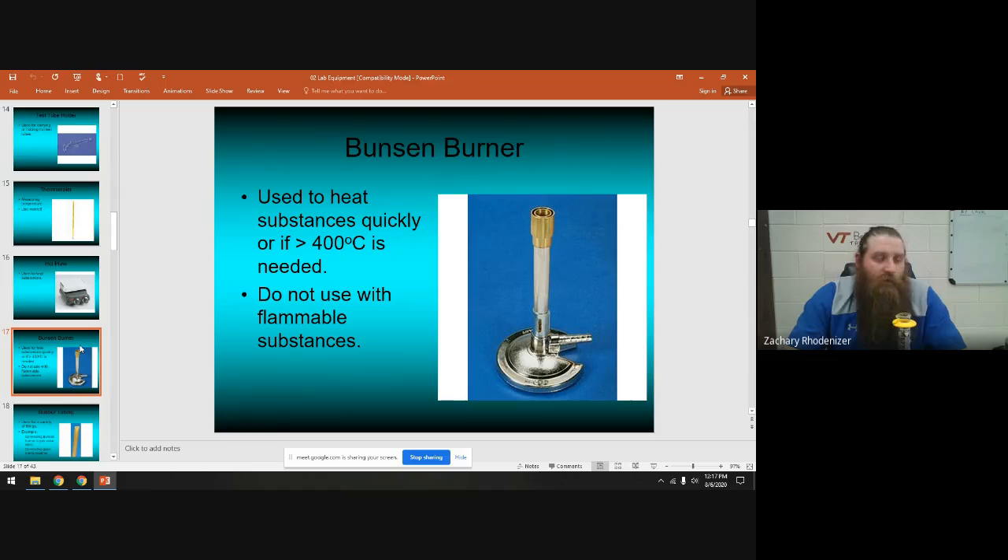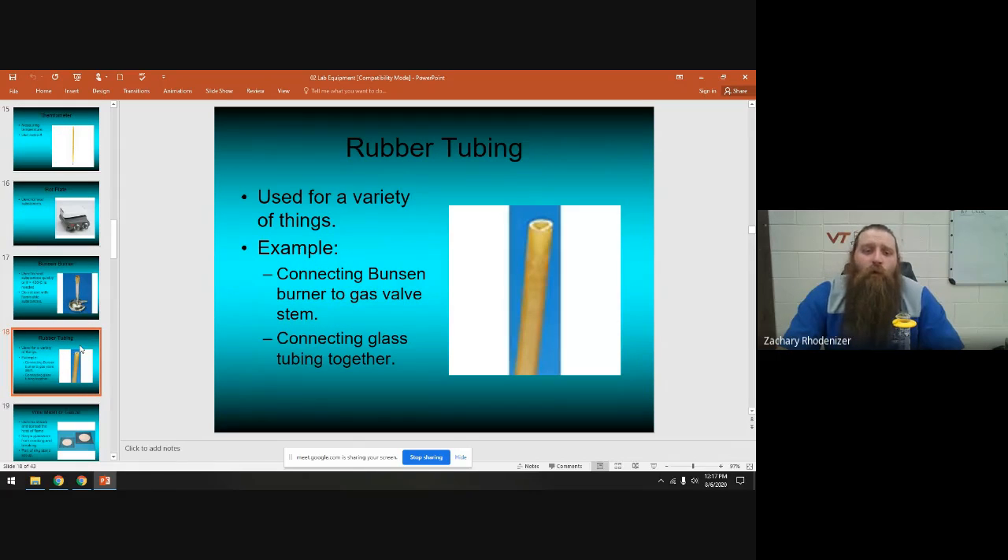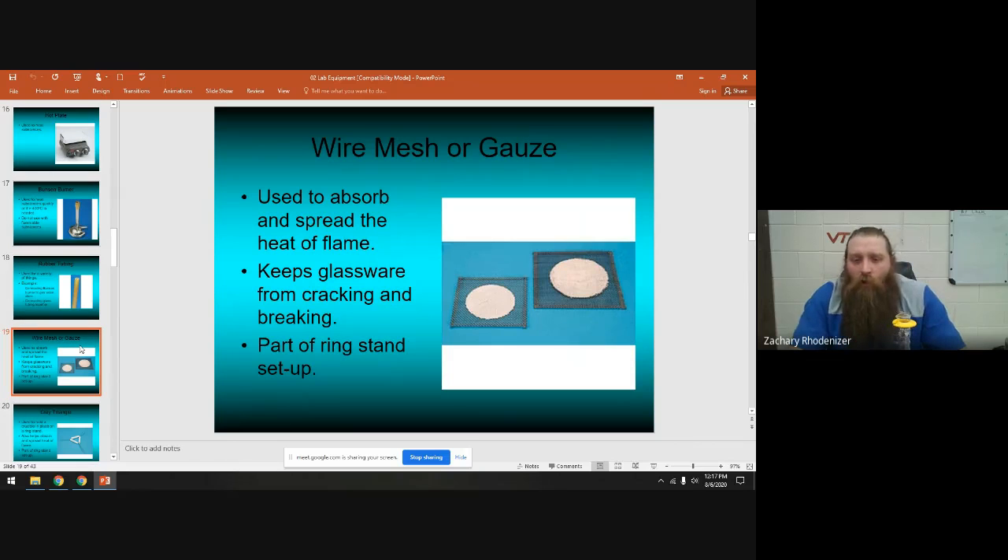This is a Bunsen burner — it shoots a big blue flame out of the top and plugs into the gas supply in the lab. Be careful because it's an open flame: make sure your hair is pulled back and loose clothing is bound up and out of the way. Rubber tubing is most often used to connect a Bunsen burner to the gas valve, but it can also move water from point A to point B or be used in vacuum filtration.